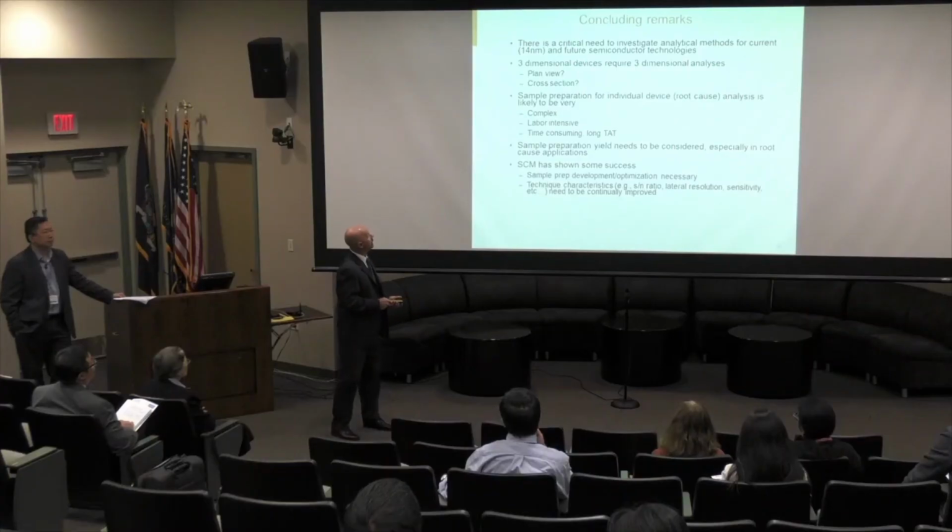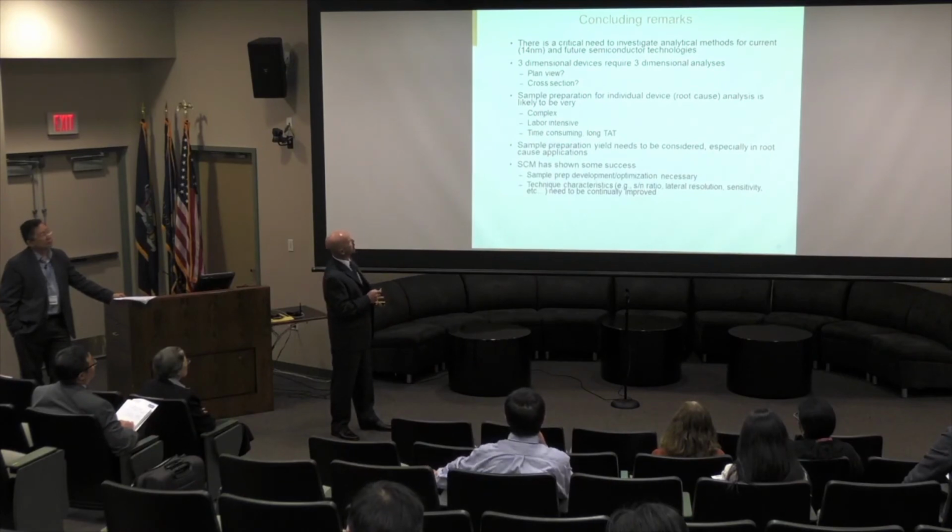The technology has come a long way, from that 1 micron device where we looked at it with scanning Kelvin probe microscopy, with that very noisy, coarse, giant image, to where we are now, looking at 14 nanometer fins and finding that defect site. But still, there's so much work to be done here.